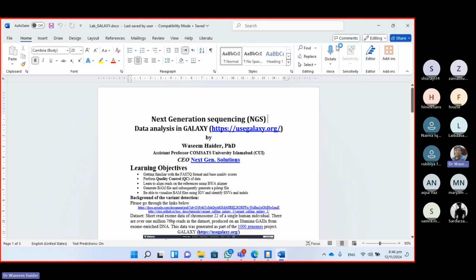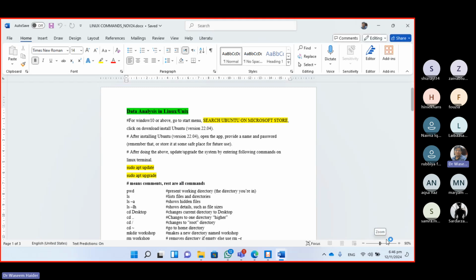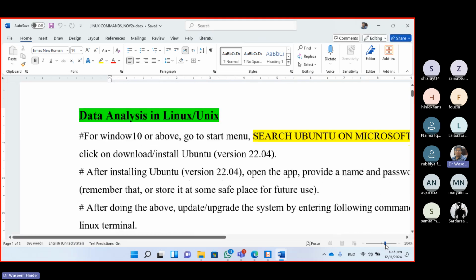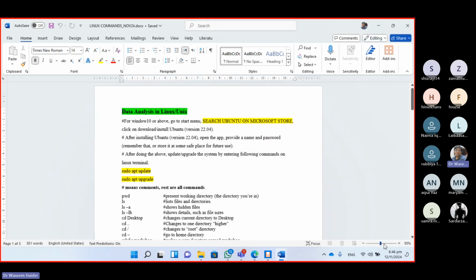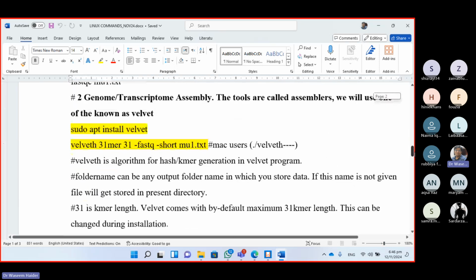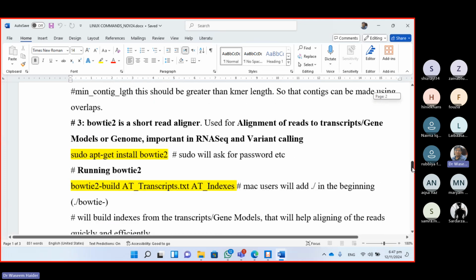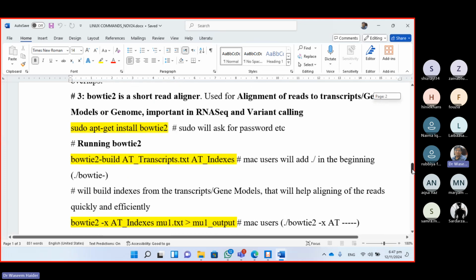So I'm waiting. Where is that document? He's opening each and every document which I used to open because it accidentally closed. It has a bad habit of opening everything. See, that's another downside of Windows. I did not ask him to open everything, that is uncalled-for help.